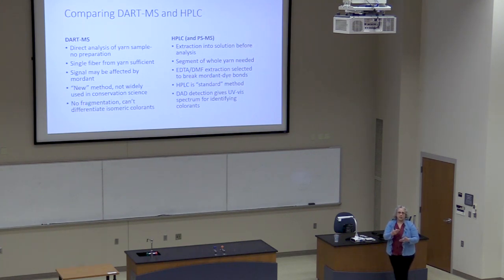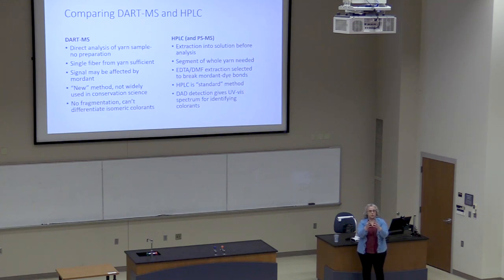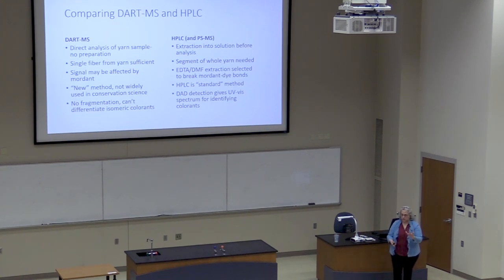Now, one of the downsides is that if you know about mass spectrometry, you know that we take the molecule, we smash it apart, and we look at the pieces to build up a fingerprint of the structure of the molecule. And while we can do that, if we do that for a whole bunch of molecules at once, which is what we're doing with DART, you just get kind of a sea of a mess. And so we might be able to fish something out of that with statistics, but if we're just trying to get a quick answer, it's going to make it way too complicated.